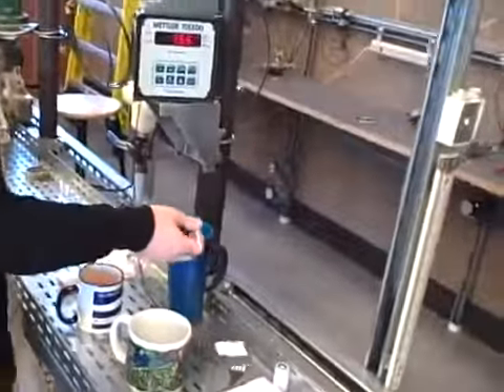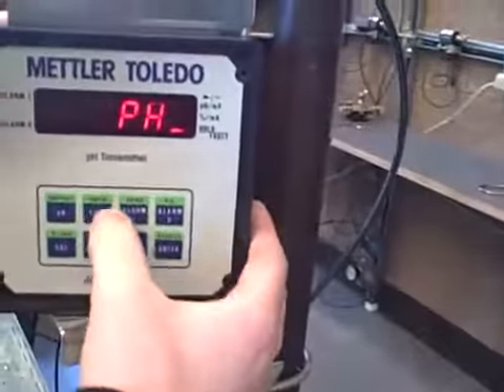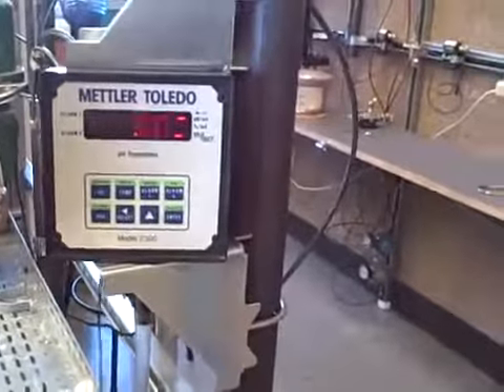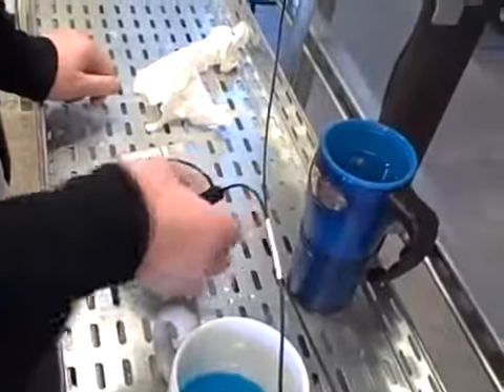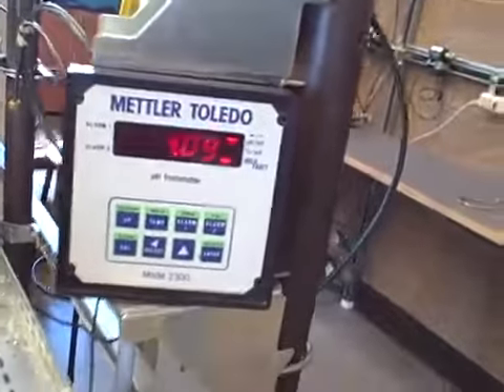I'm going to use those for my two test points to calibrate my instrument. First thing I'm going to do is push the hold key twice to get into calibration mode. After I get into calibration mode, I am going to place my pH meter in the first buffer. This has a pH of 4, so hopefully my meter goes down to around 4 if it's properly calibrated already.